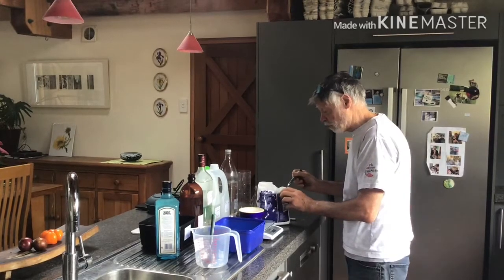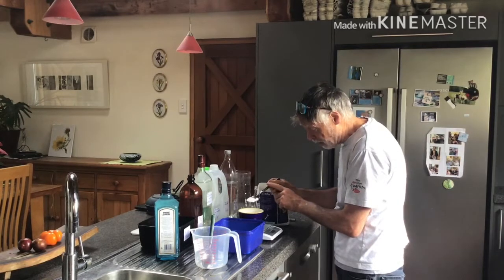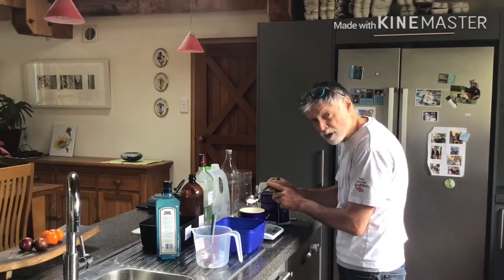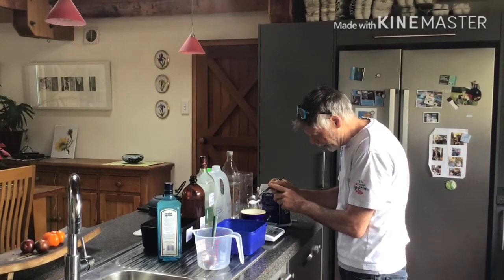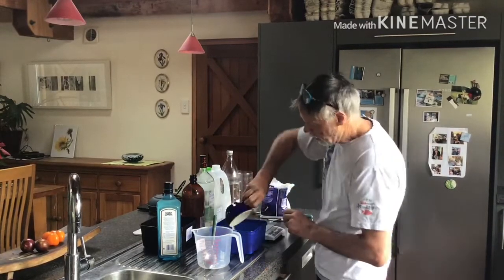Now I hope when you've been making your solutions that you've been mixing really thoroughly, and again, being very careful. We're going to need these solutions to be as spot on as we can get it to minimise the error for our next activity. 5 grams it is. Mix that in and make it dissolve.